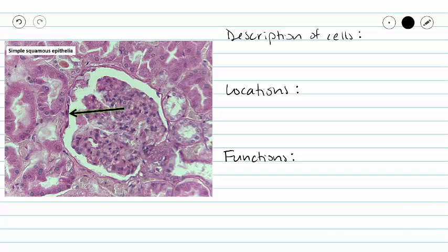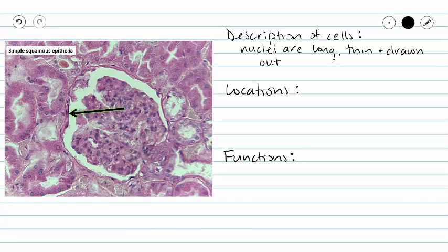Here we can see the same glomerulus in the middle — that's our glomerulus, a blood vessel network. Bordering our white space, we have simple squamous cells. We've got a few nuclei, and our nuclei are going to be long and drawn out. Our cells are going to be very thin as well. We can see some good nuclei here that are pretty thin and drawn out.